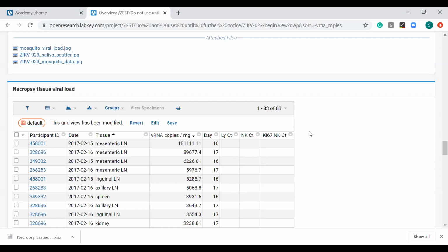So that last question was actually referring to study. If you're using a demographic data set without a time primary key, yes, that is also possible within the study. If you just have a participant ID, you can pull that into other data sets as well. We'll take a look at that when we actually build something out. I think it'll give you a more concrete sense of how that's done. Okay, cool. Thank you.